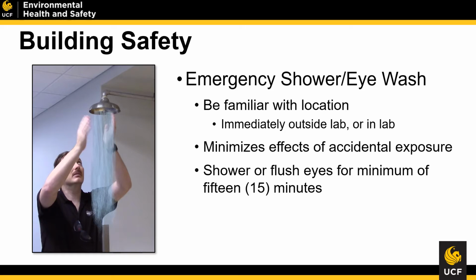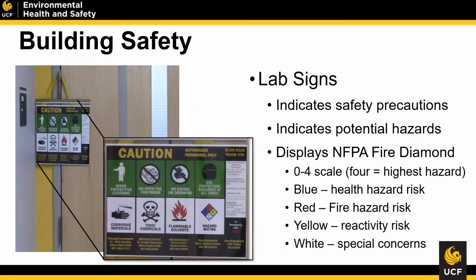In the event you need to use an emergency shower or eye wash, we definitely want you to use it, but our PPE and good laboratory practices will prevent the usage of this for the most part. So if you don't have to take a cold shower, follow proper safety practices, and you might not ever have to use this. Here at UCF, before you enter a lab, we have signage that indicates what hazards are present within the space. We also have signage that indicates what are university policy. So, if you look at a laboratory safety sign before you enter, there will be several green boxes indicated at the top left side of the sign.